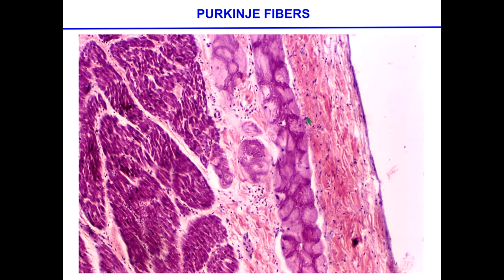Picture of Purkinje fibers. Okay. Again, if we were to identify this, the slide is in the reverse position relative to the one that I showed you during the lecture. So this is the endocardium, and these are the Purkinje cells, and these are the actual myocardium that contains all the actual real typical muscle cells from the cardiac tissue. Questions?